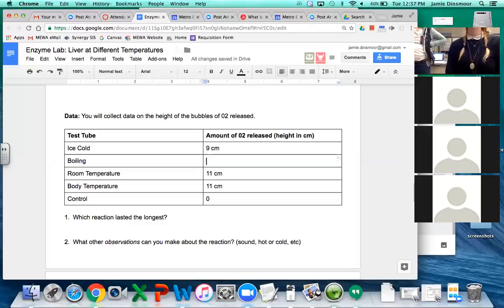Boiling. Oh yes, the liver looks nice and boiled. That looks beautiful. All right, let's see. How am I going to touch it, because I don't want to burn myself. Where are the tongs? Is that going to break it?